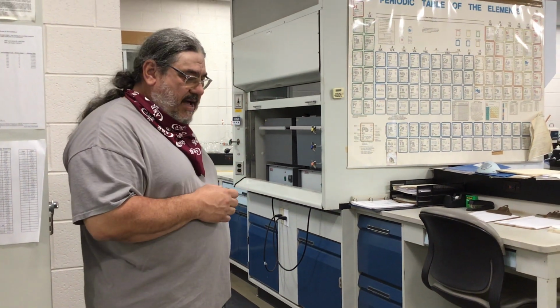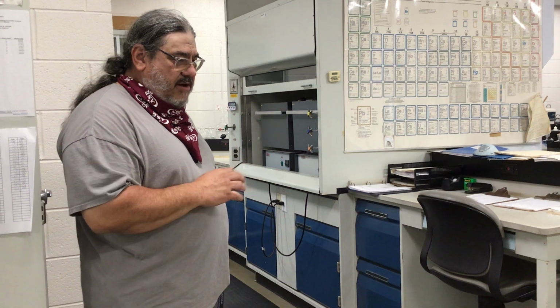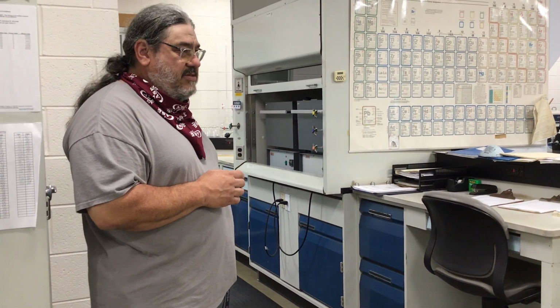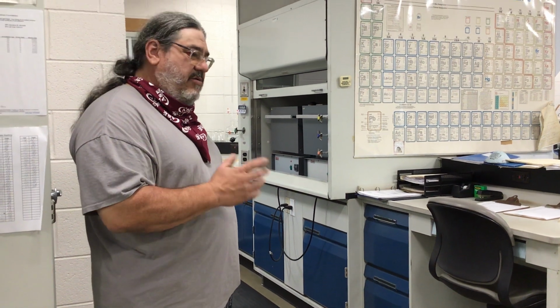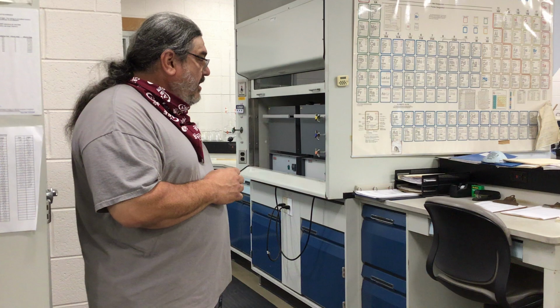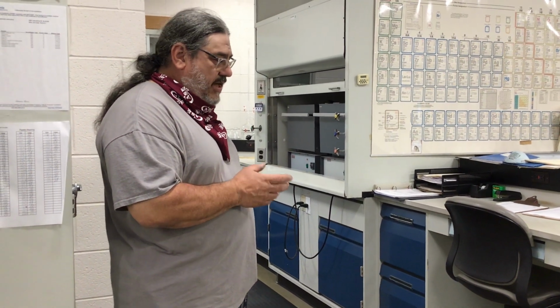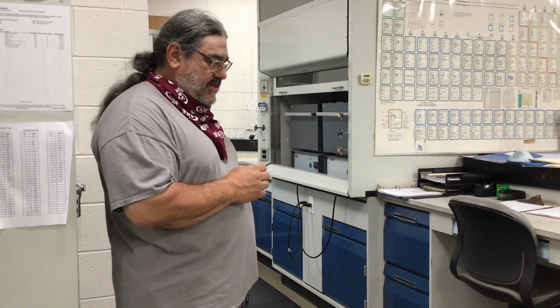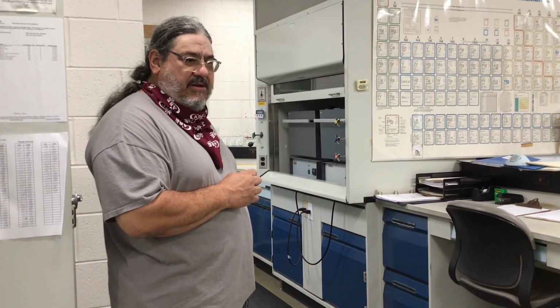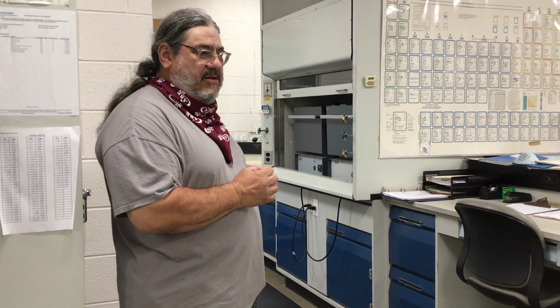Some work is sent out as well, both to verify our own numbers and for some other compliance work. Some of the testing is sent out. We don't have the capability in-house to do everything. And so that's process control and compliance testing. For compliance testing, all that data is compiled and submitted in a monthly report to the state DEP. All that is now submitted electronically.